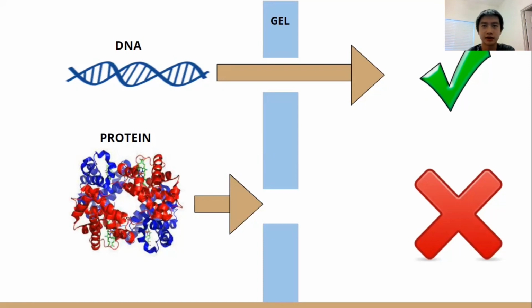This makes it difficult for some proteins to fit in the microscopic pores of the gel, which is problematic because it would cause the protein bands to form due to properties other than density and size alone. Additionally, the R groups of amino acids can cause other complications due to their charge and ability to form bonds such as disulfide bridges with other R groups. These complications resulted in the need to treat proteins appropriately before gel electrophoresis.